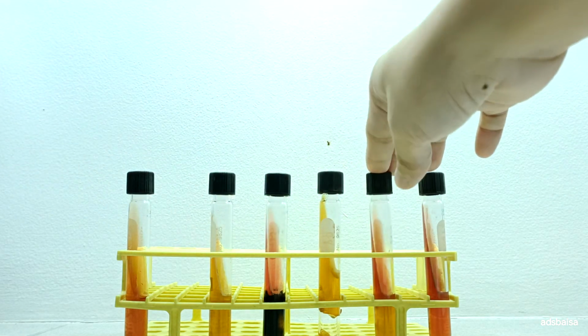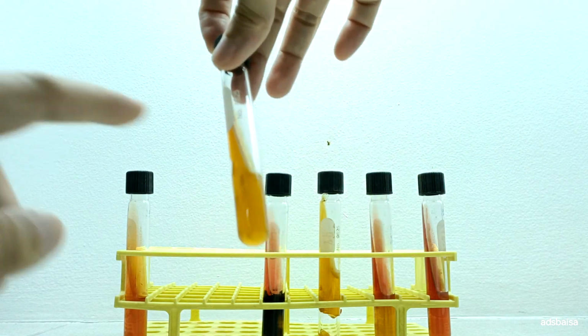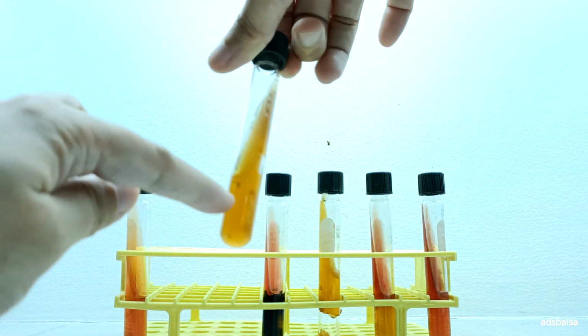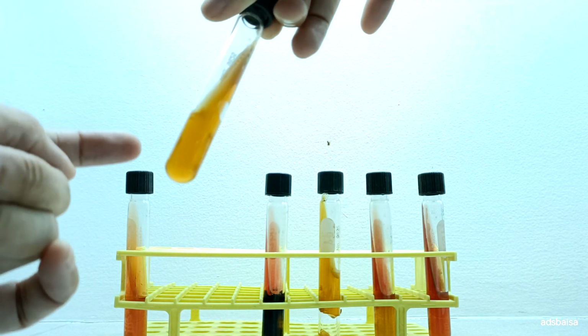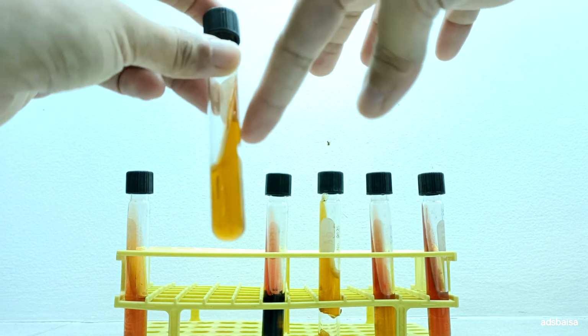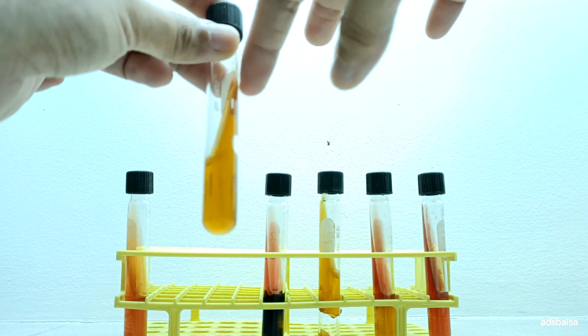So next we have the A over A. Both are yellow, slant and butt, so it is written as acid over acid or yellow over yellow. This is due to the fermentation of lactose and sucrose. So meaning the bacteria was able to ferment lactose and/or sucrose.